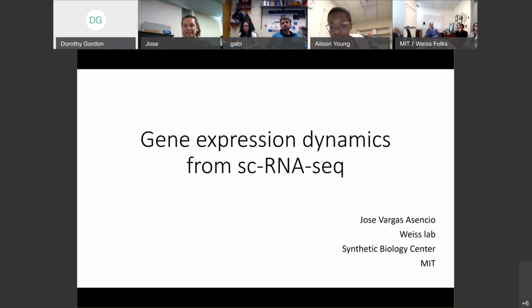So I think maybe I can start. Today, unfortunately, unlike Ron mentioned, I'm not going to really do an introduction. I'm mostly going to talk about a system we use where we study organoids and some novel ideas of how to look at single cell data to extract gene expression dynamics. Hopefully, if anyone has some thoughts or comments about these recent directions, we're currently developing this way of looking at data, so I really welcome feedback.